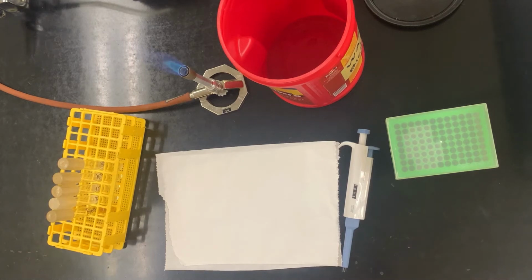The purpose of serial dilutions is to take a sample, such as a broth, and dilute it to the point where, when we ultimately plate our sample, we can get a reasonable number of colonies on the plate so we can quantify it.